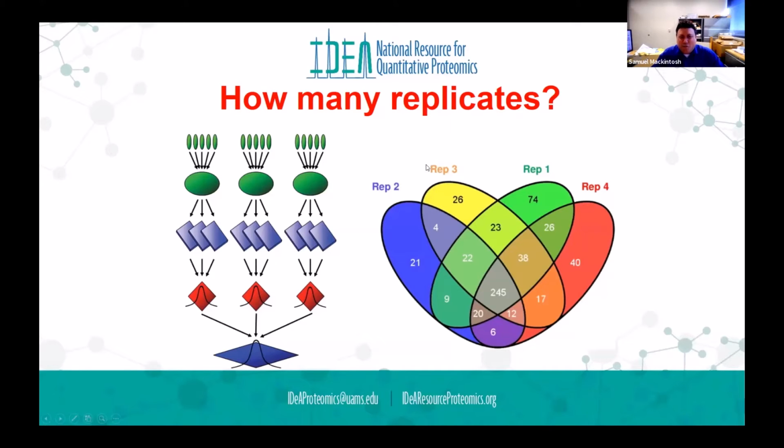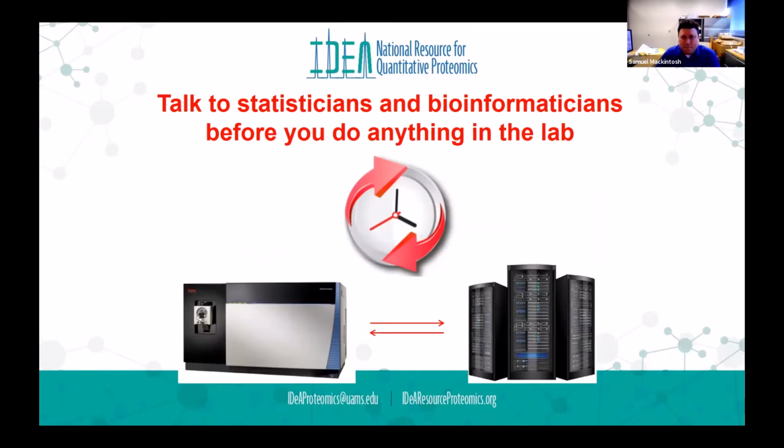You can still do pilot type analyses with single or dual replicates if you need to, but it's not recommended, and it generally doesn't yield standalone publishable data without at least 3 replicates. Now, depending on the type of sample and the type of experiment, if you can get to 5 replicates, that's generally much better, and it puts you on a sounder footing in terms of data analysis.